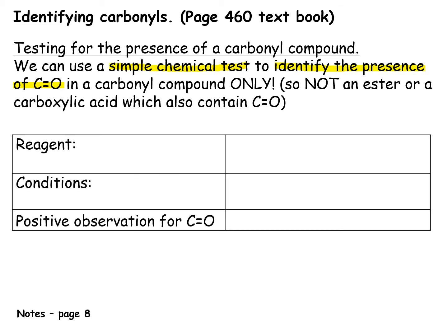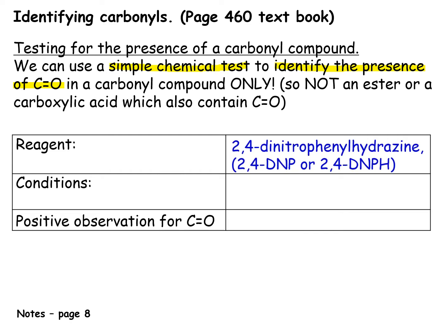So the reagent then for this, 2,4-dinitrophenylhydrazine. Now that is a bit of a mouthful, so it's often referred to as 2,4-DNP or 2,4-DNPH. So 2,4-dinitrophenylhydrazine is the reagent, that's the chemical that you would add.